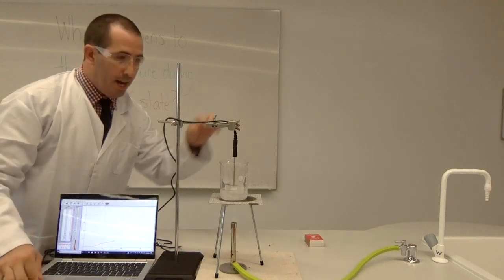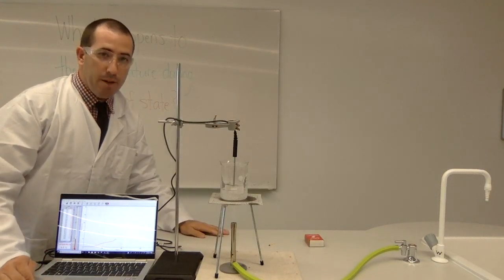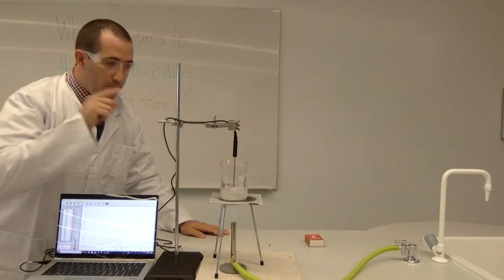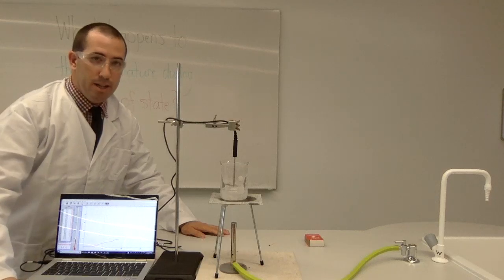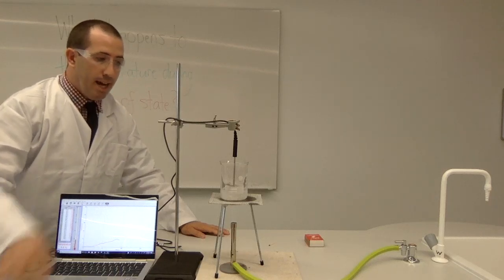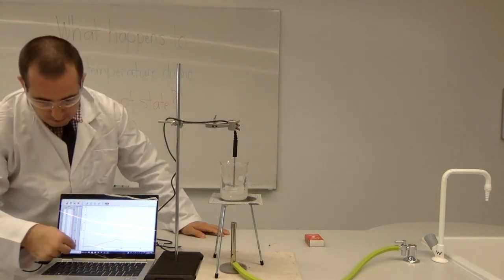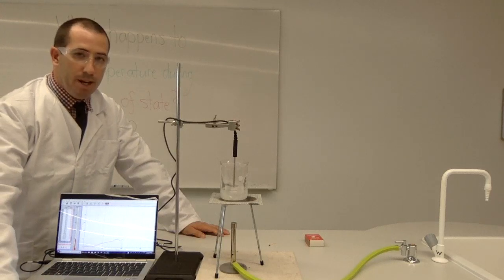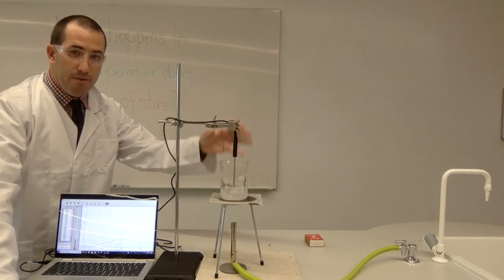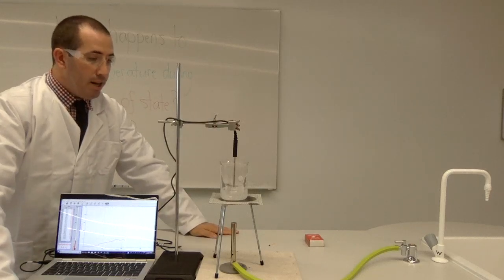Now we are using a digital thermometer for accuracy purposes. Why is it accurate? One, there's no parallax error. The reading goes directly to the computer screen. Two, it's calibrated so that each change in degrees is exactly what's going to be shown here. So hopefully this will give us a very accurate reading of the temperature as it goes from a solid to a liquid to a gas. Now we're going to see what happens here.